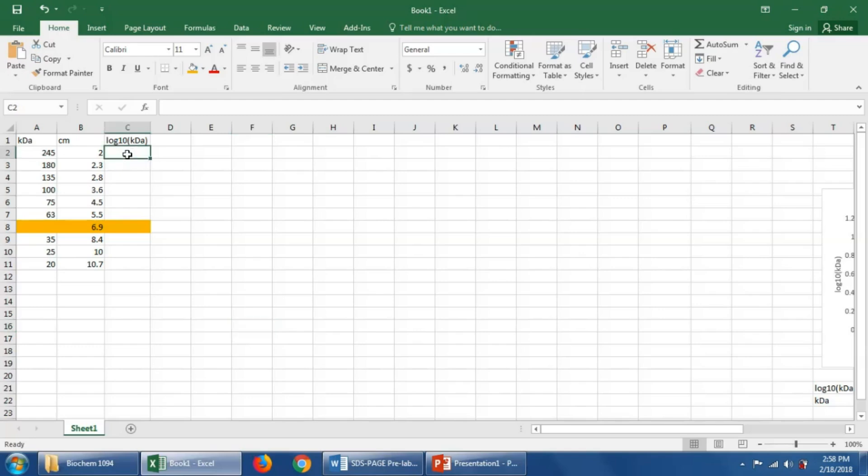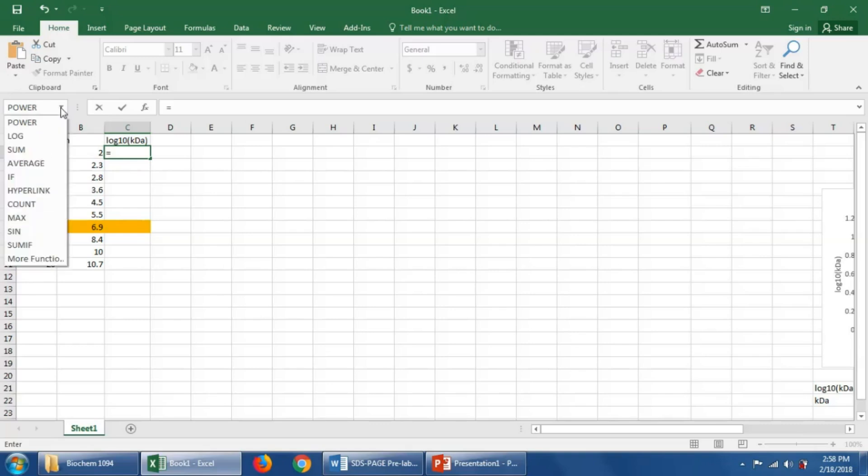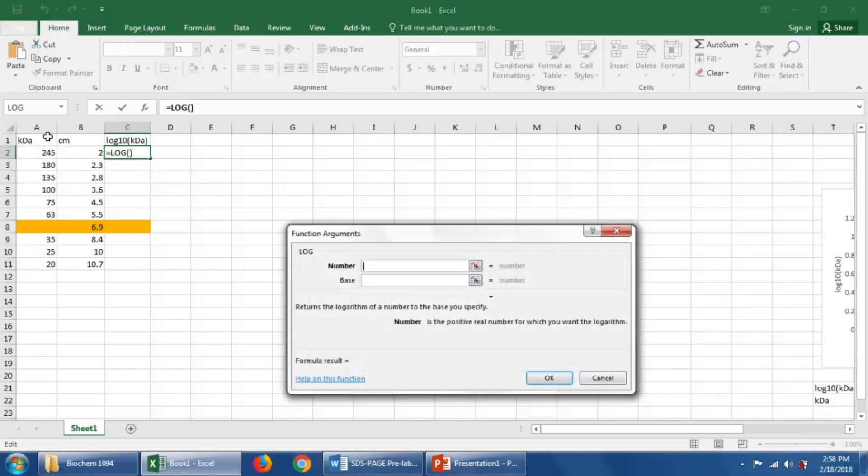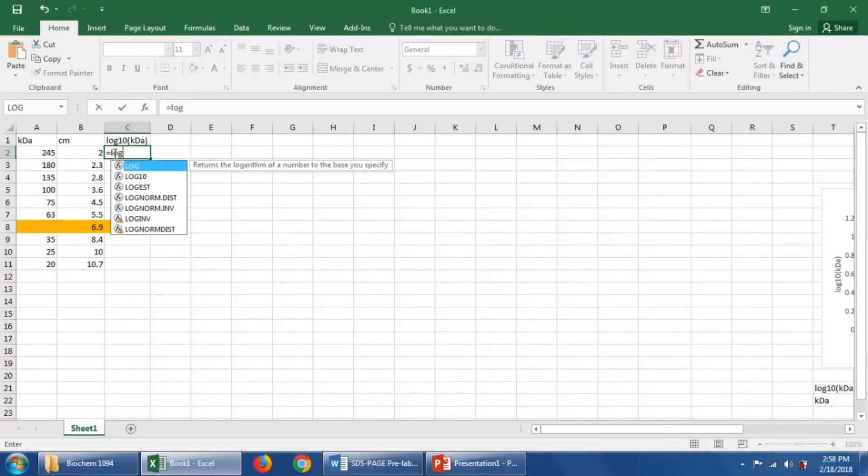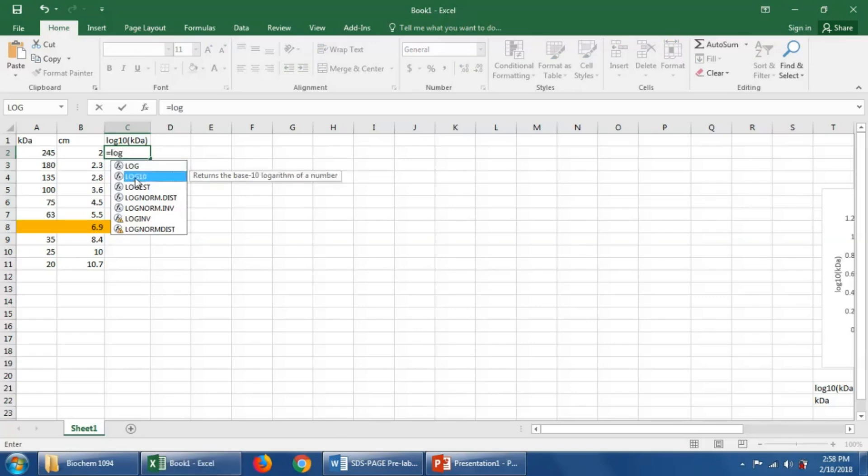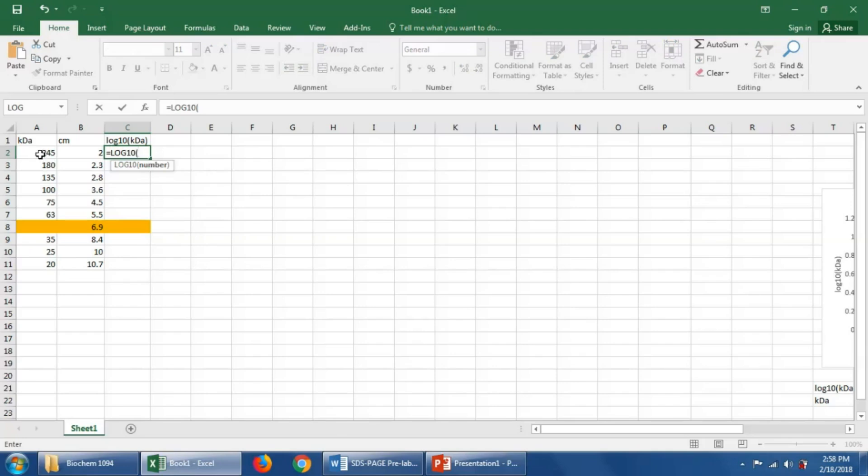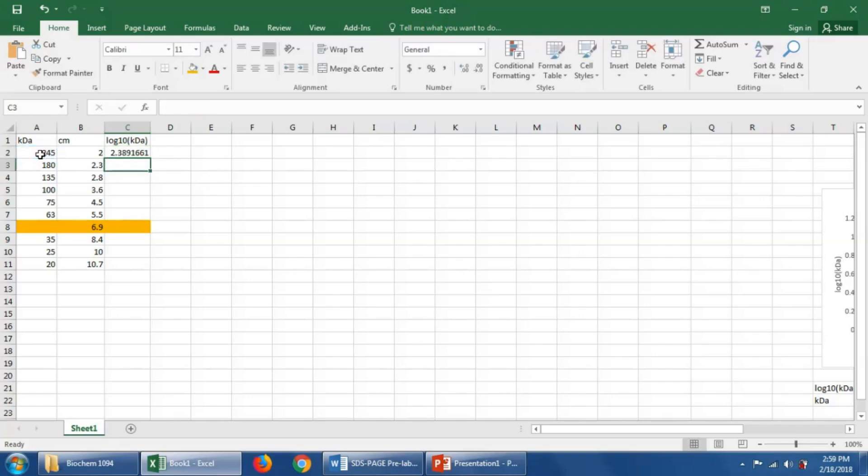In Excel we can do that by typing equals, finding the appropriate function. Equals log and we'll pick log base 10. Double click that and click this cell here that we want to make the log base 10 of. Close parentheses, enter. So we calculated that.